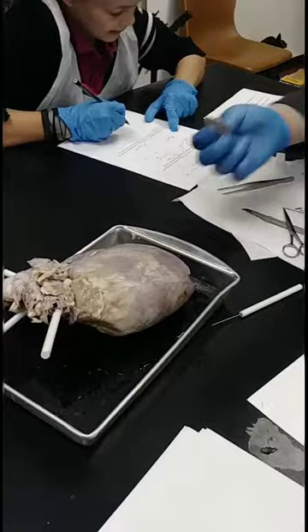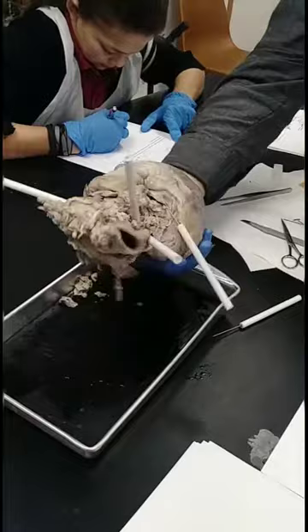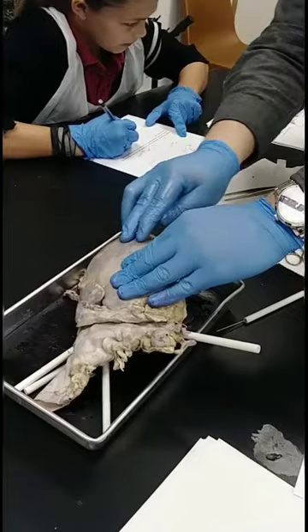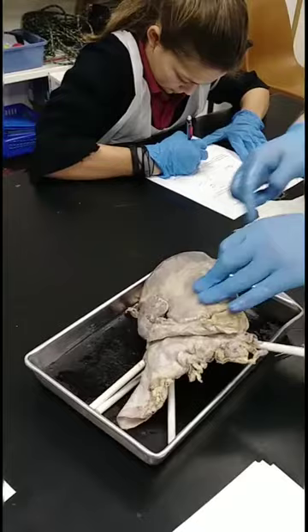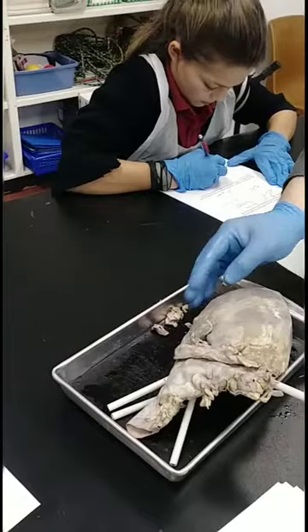So when you're ready, and you've got all of step two done, go ahead and think about cutting into this so we expose some of the ventricle. We'll spend more time with this tomorrow. I have a large knife up here to help you guys out. We'll just try cutting into this and seeing more of this myocardial tissue, more of the muscle tissue. Make sense? Right in that groove that separates the left ventricle over here, and the right ventricle. Right?